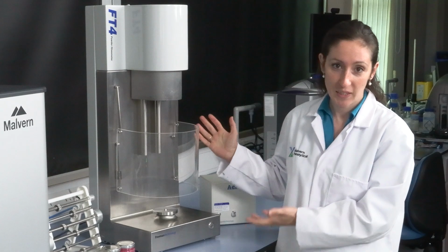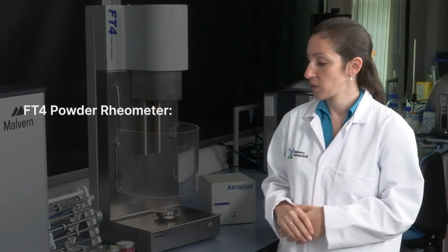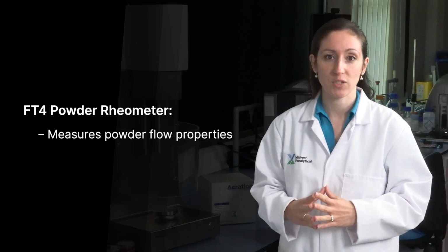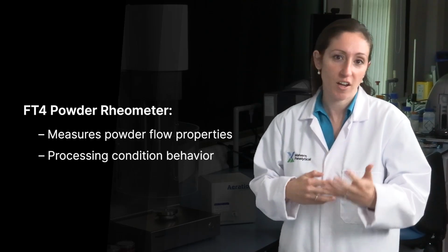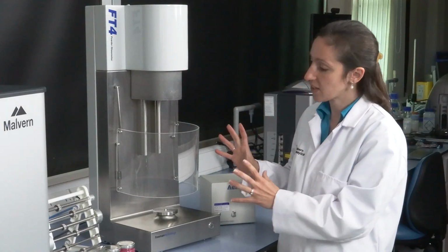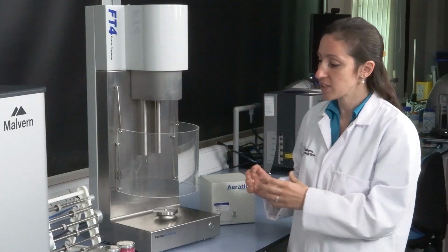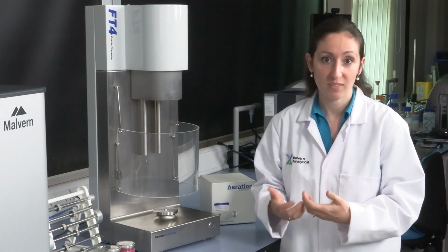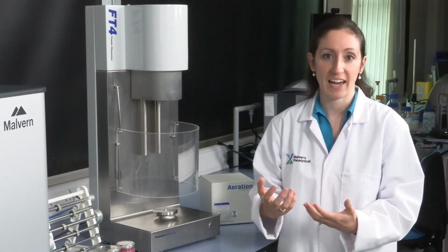This that I have next to me, this is the FT4 Powder Rheometer. What it does is it measures powder flow properties. It characterizes how powders will behave when they are under processing conditions. The way that it works is by introducing the powder and simulating different amounts of shear and stress and measuring, quantifying how the powder reacts to those processing conditions.